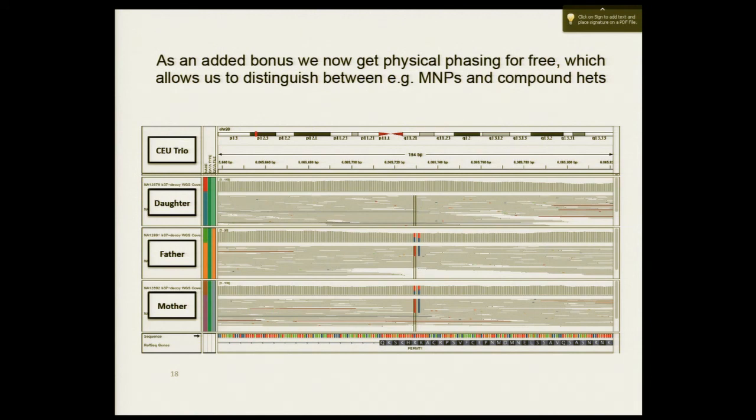There is no way to report in the same line to represent the haplotype itself, to show that they are linked together. Well, he's asking about a specific thing there. He's asking about emitting all sites, whereas if you run this in discovery mode, then you would discover this variant, and it would treat this as a single variant, and you would get one line. So that's the difference. Does that make sense? The position would be the first position running left or right along the reference.